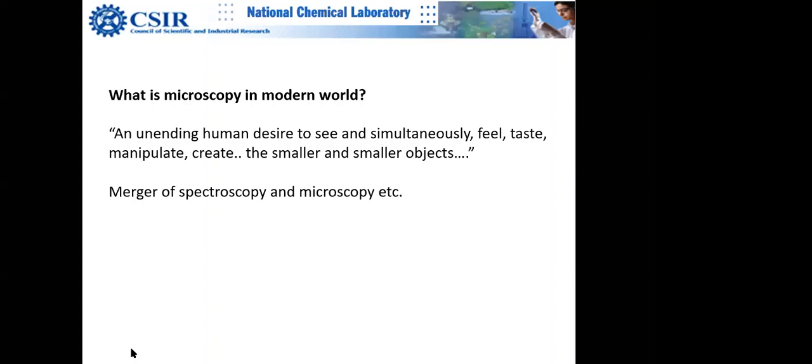So all those things are possible, and if chemistry students are interested in looking at live reactions, of course they would like to have control over temperature and pressure, and they would also like to introduce some gases. Of course, you can't put a beaker there. Don't expect to do that. But you also have to compromise as a student: I will miniaturize my reaction and carry out a small one.